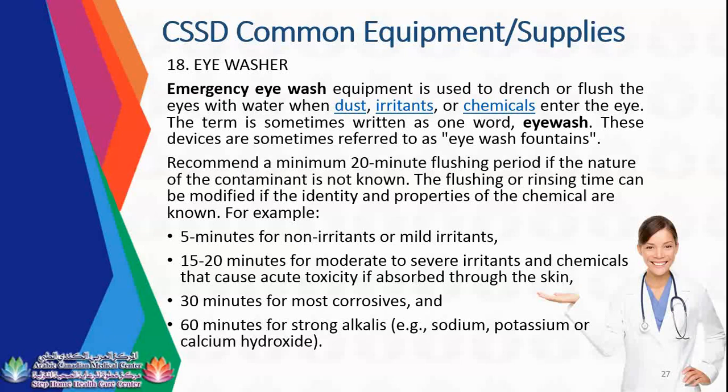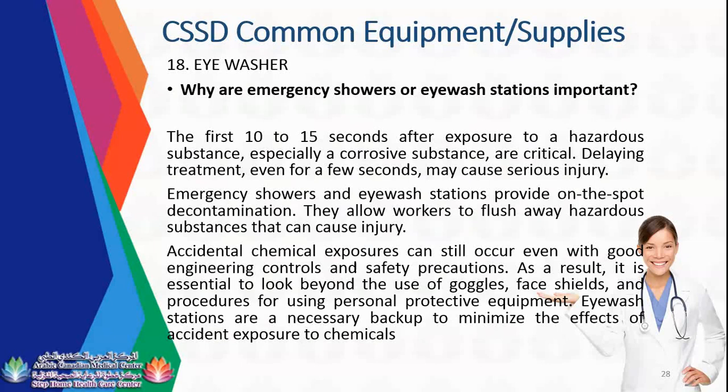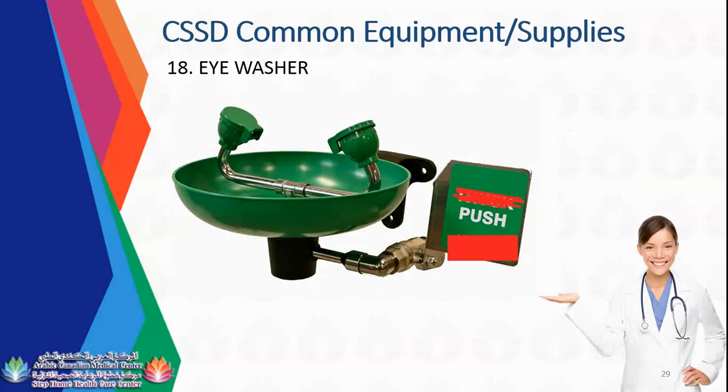So why are the emergency shower and eyewash station important? The first 10 to 15 seconds after exposure to a hazardous substance, especially a corrosive substance, are critical. Delaying treatment, even for a few seconds, may cause serious injury. It can cause blindness, depending on the chemicals. That's the reason why there's an eye washer available. If there's no available eye washer, then use the sink. This is your sample eye washer. It is easily paddled. Once you push it, it will generate water.